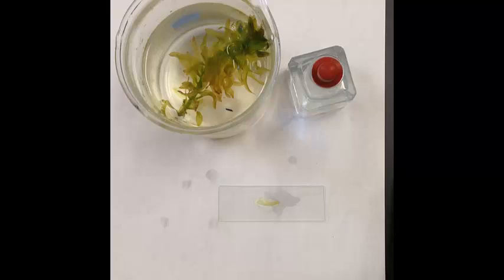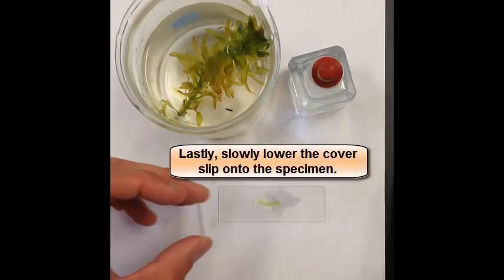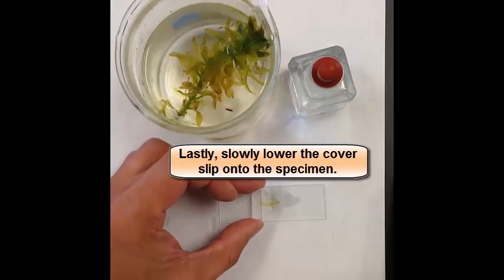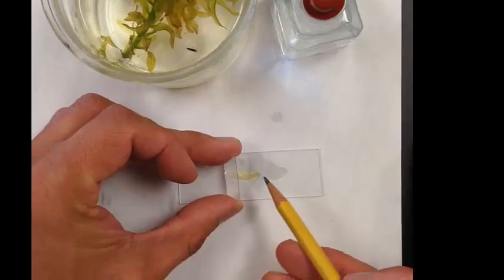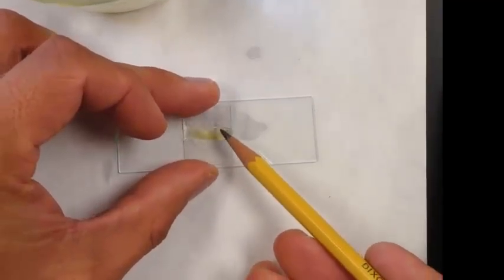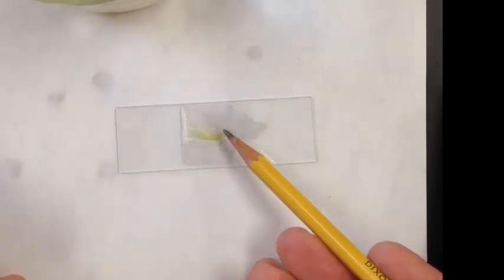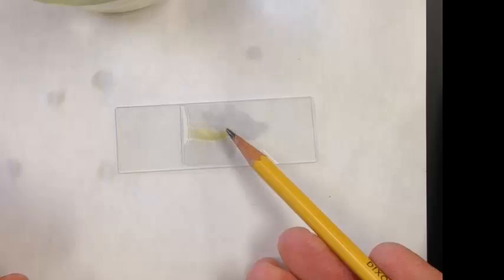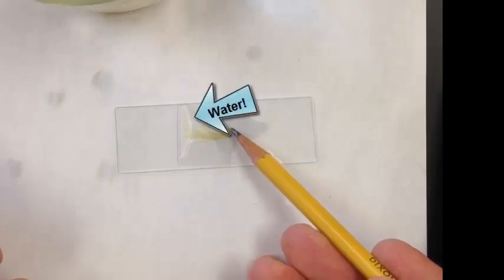The tricky part is putting on the cover slip. When you do the cover slip, the first thing you should do is stand it straight up, so you have one edge of the cover slip on the slide. Then you want to slowly lower the slip and rest it on a pencil or a pen — a sharp pencil works best. You're going to slowly lower the cover slip down onto the slide, and as you can probably see, the water is starting to spread out underneath the cover slip.